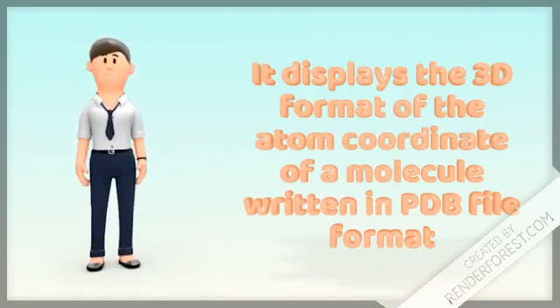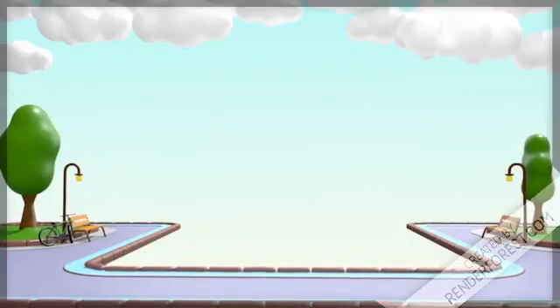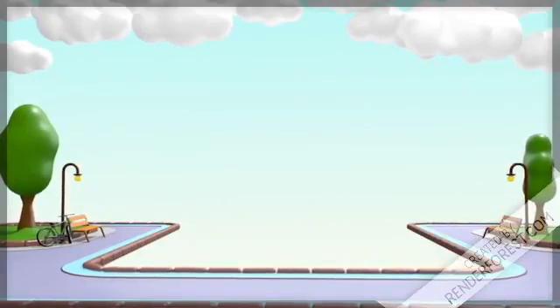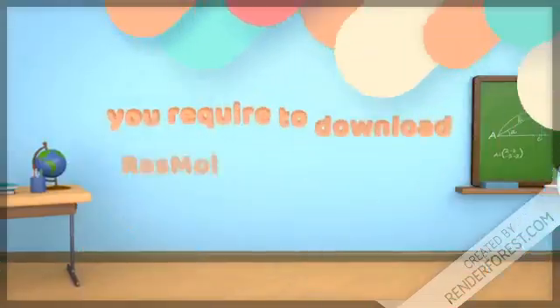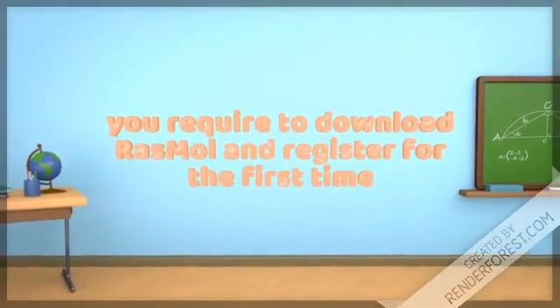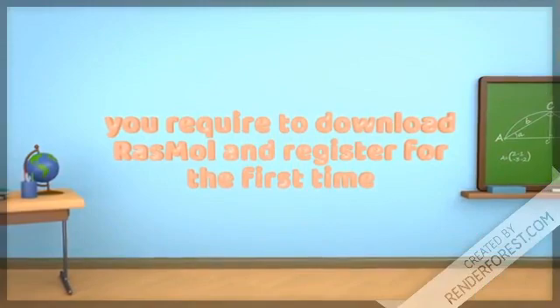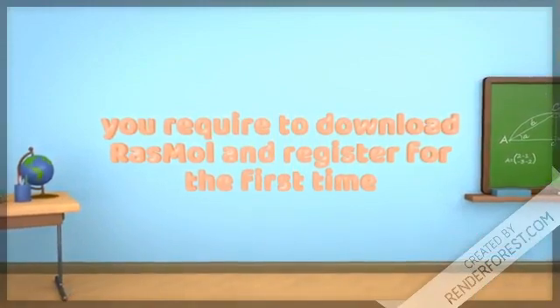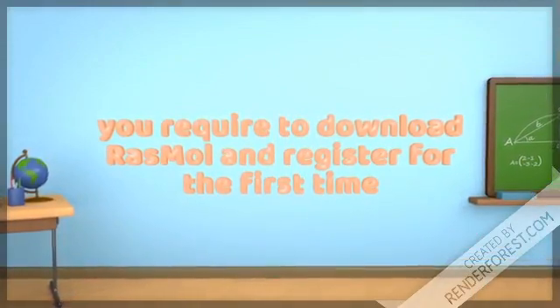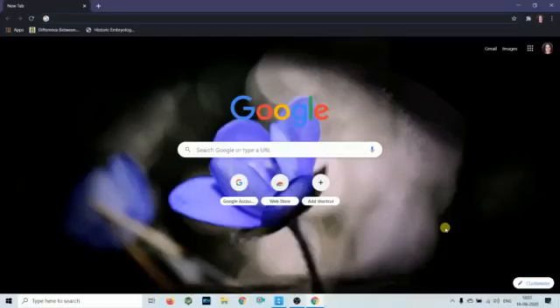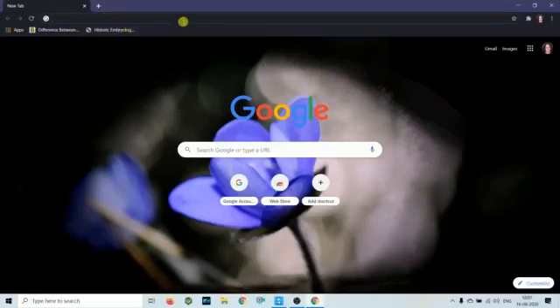Thank you for joining us. In this video, you will learn how to visualize the structure of proteins by using RasMol software.